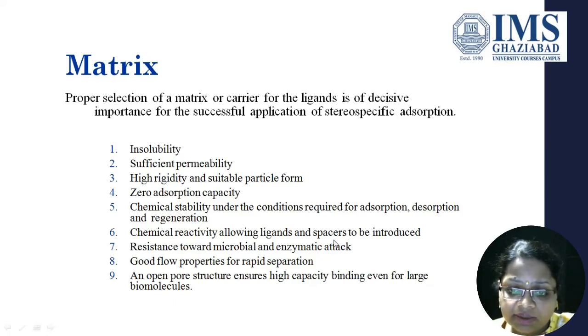The term spacers I will be introducing in the next few slides. It should have resistance towards microbial and enzymatic attacks. It should have good flow properties for allowing rapid separation, and the pore structure should ensure high capacity binding even for large biomolecules.